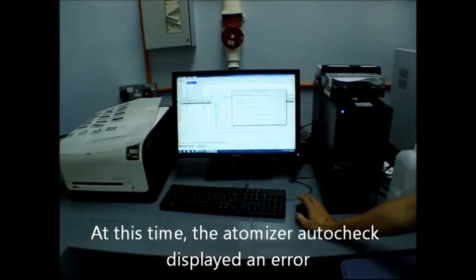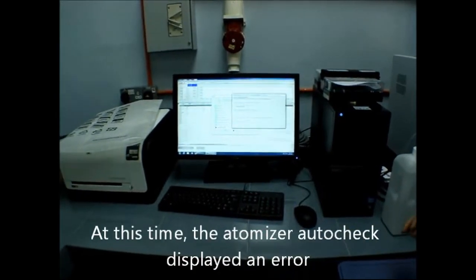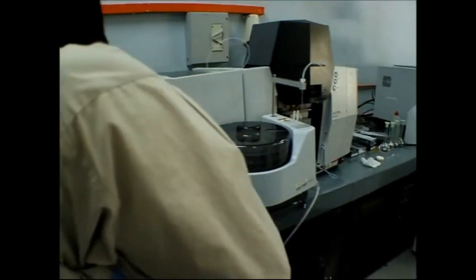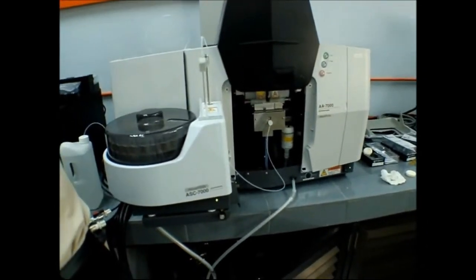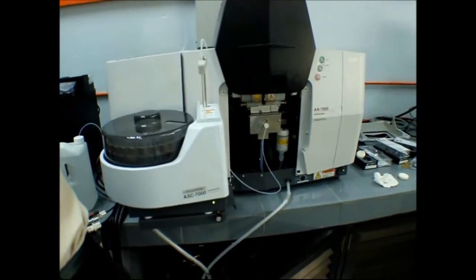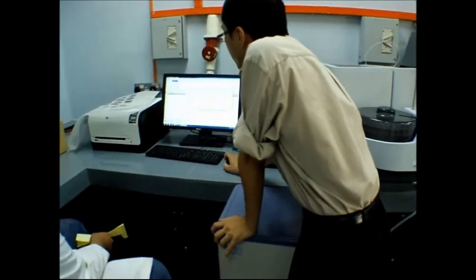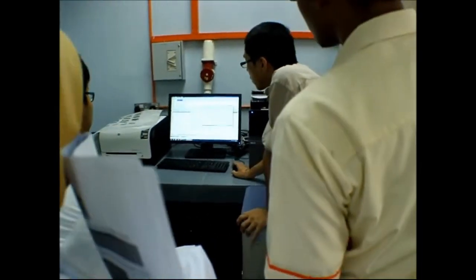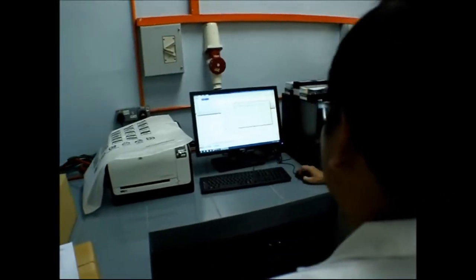You can purge, but we are not using this one. Still I cannot initialize properly, so no use now.